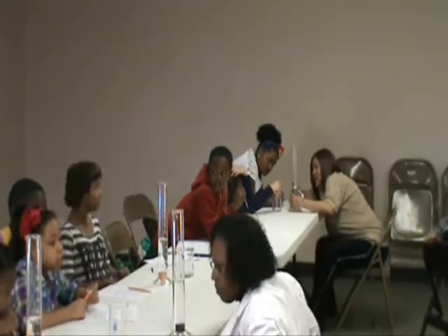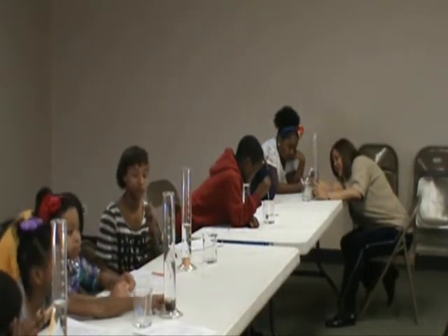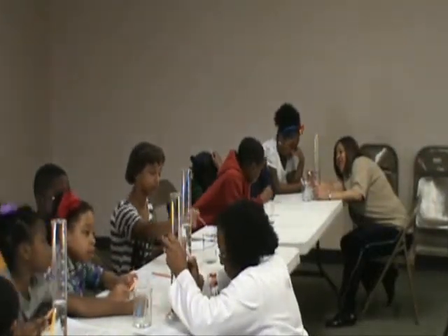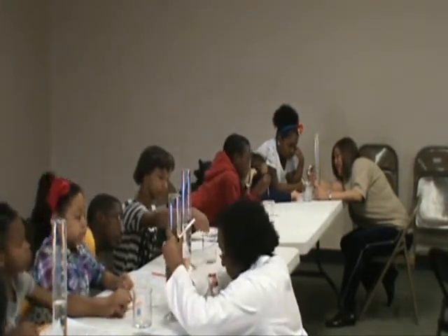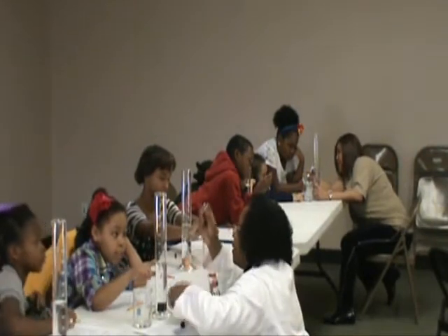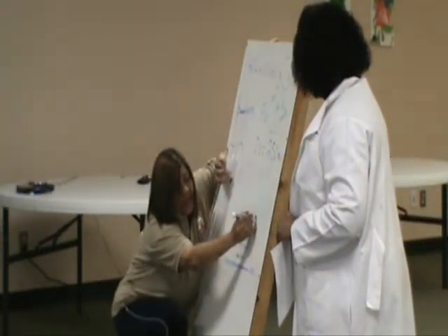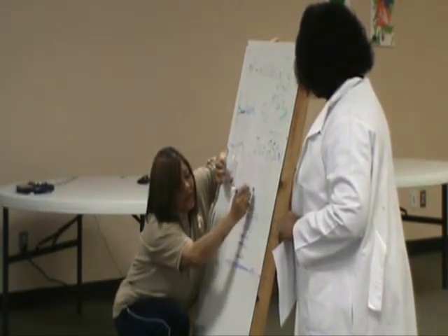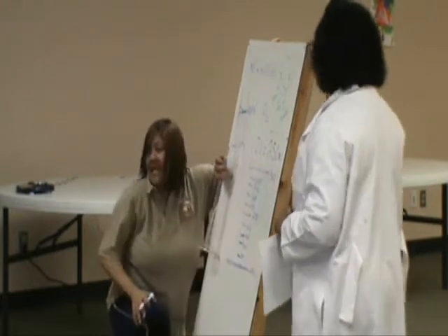Now, look. Watch me. Okay, this is 250, right? See how this line is longer than those? This is 275. So this is 250, 255, 260, 265, 275, 280, 285, 290, 295, 300. Each of these are 5. So what is this? 250, 255, 260, 265, right? Where we put 265, and then it goes back to short. Look, 280, 285, 290, 295, and then long again. 300. Do y'all see that?